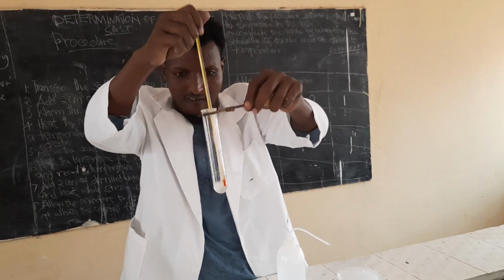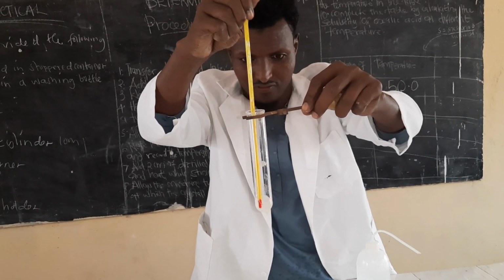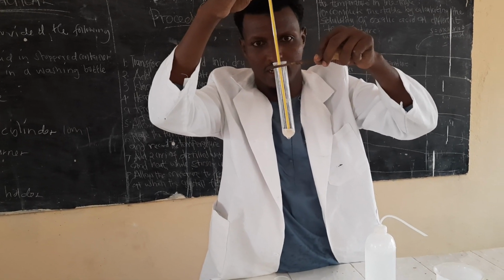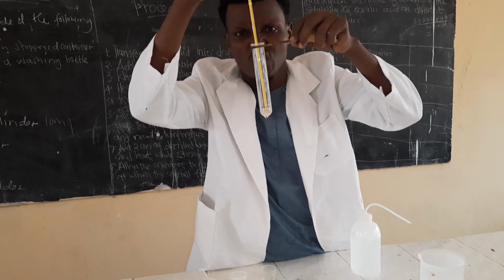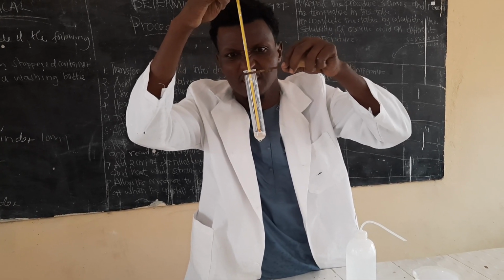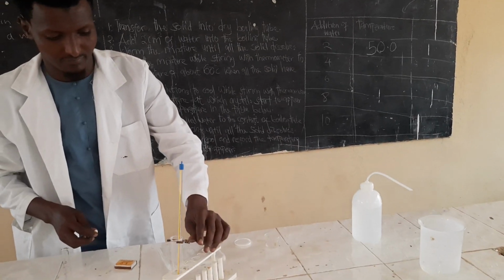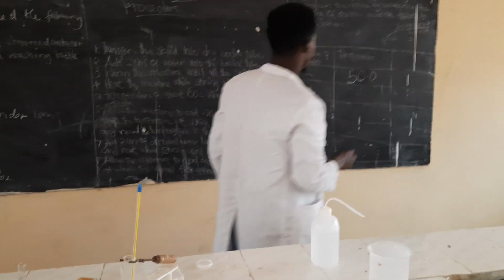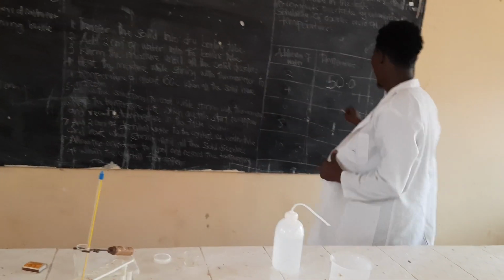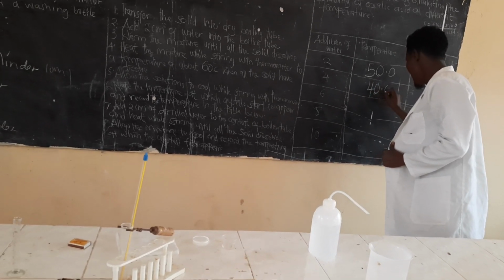Do you see the crystals starting to form? Yes, that is now 40. Then you come and record it here: 40.0.